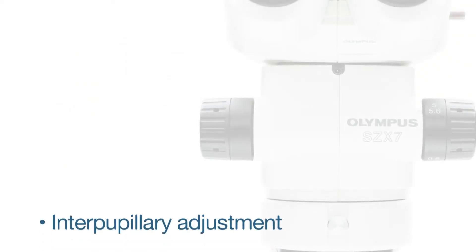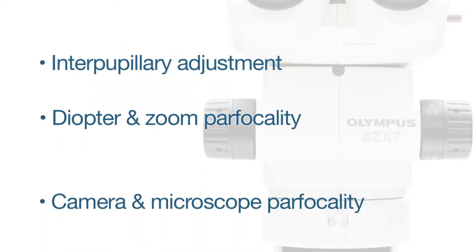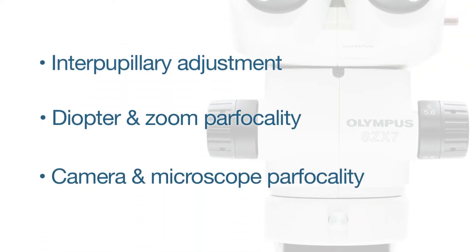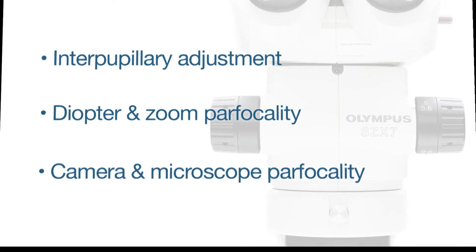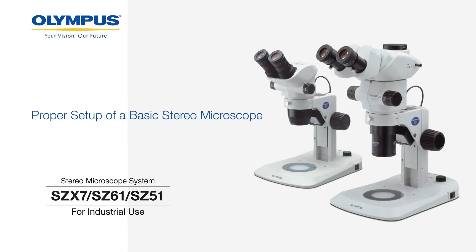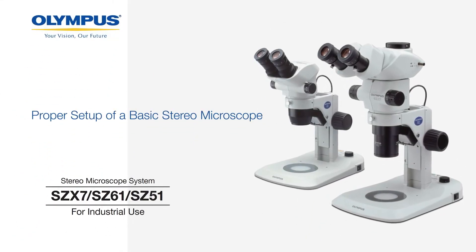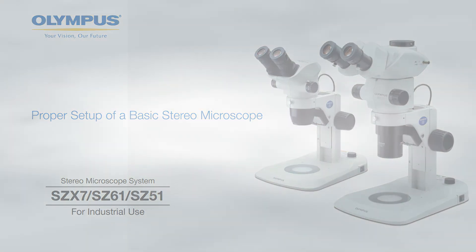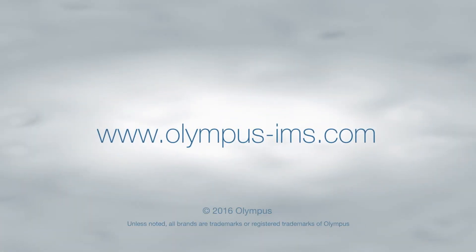By making the three simple microscope adjustments discussed in this video, users will be able to make more comfortable and efficient observations. For more information on Olympus Industrial Microscope Solutions, contact your local representative, or visit our website at www.olympus-ims.com. Thank you.